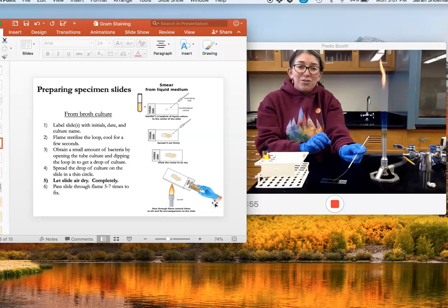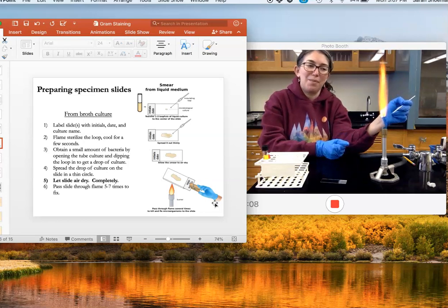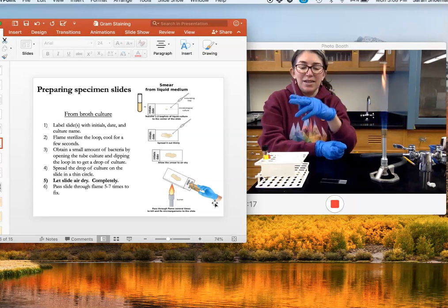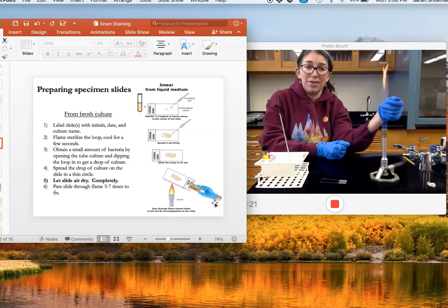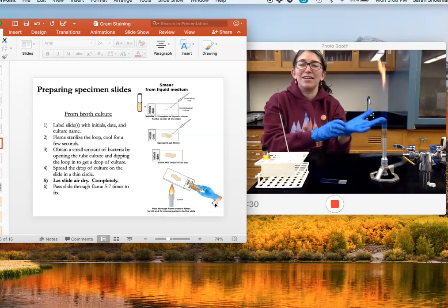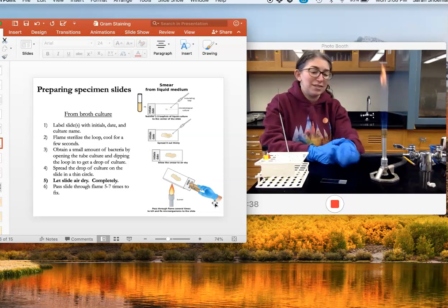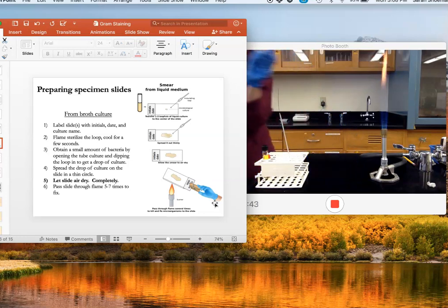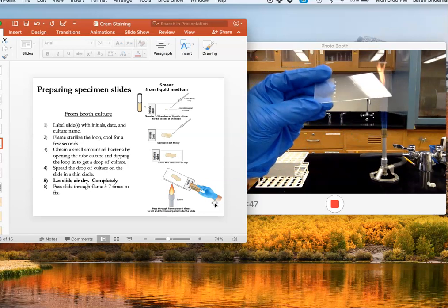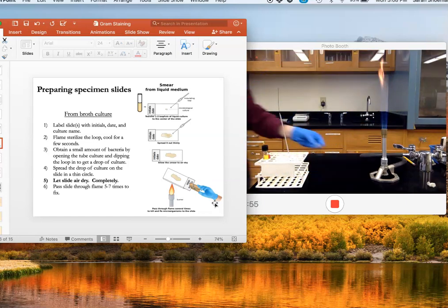Now the next step is to air dry the slide. Air drying is faster if you spread the sample out really well. The air drying step is actually the longest step — it usually takes about 10 minutes to completely air dry, and it's important to let it completely air dry. Because the next step is to run the slide through the flame to fix the cells, and if the cells are still wet we're just going to boil them, which will change their morphology and not give us an accurate picture of how they look. You can tell it's dry when you no longer see a glossy wet area, just a dried filmy residue.